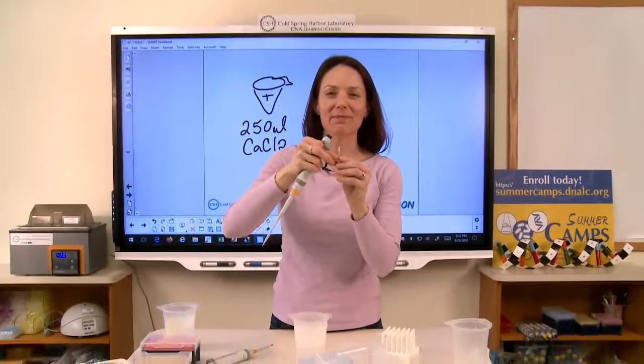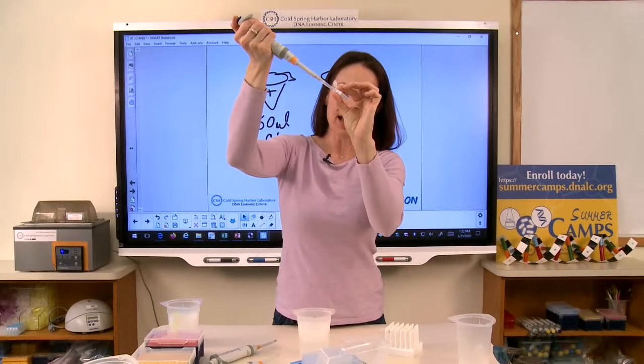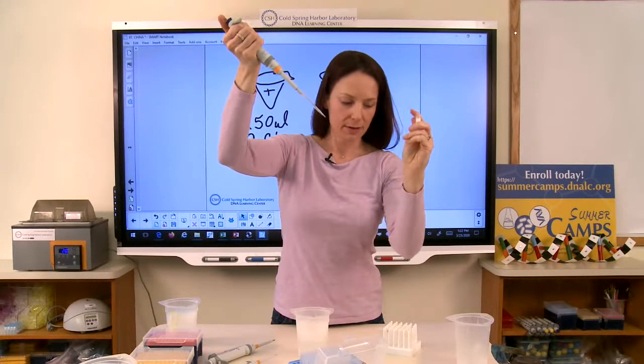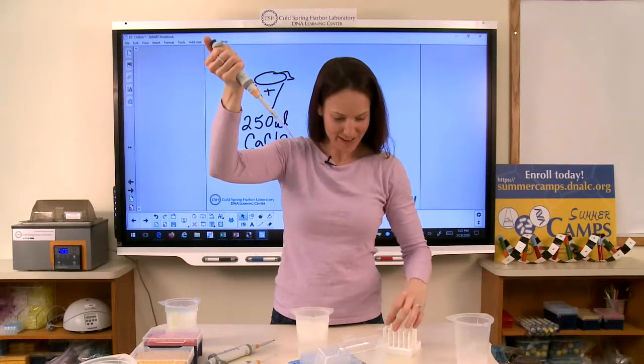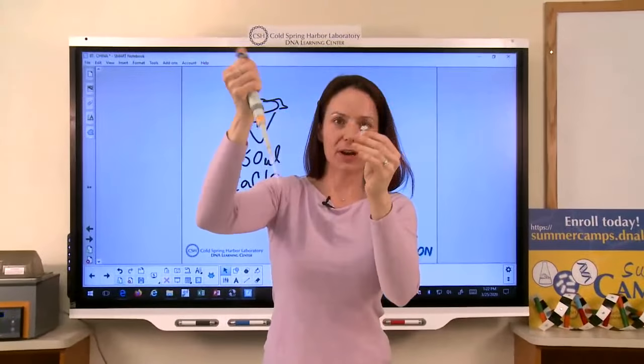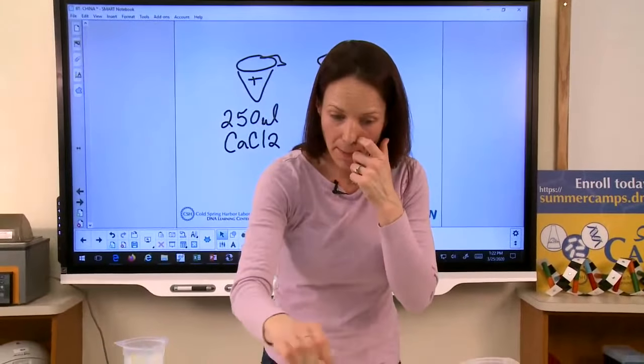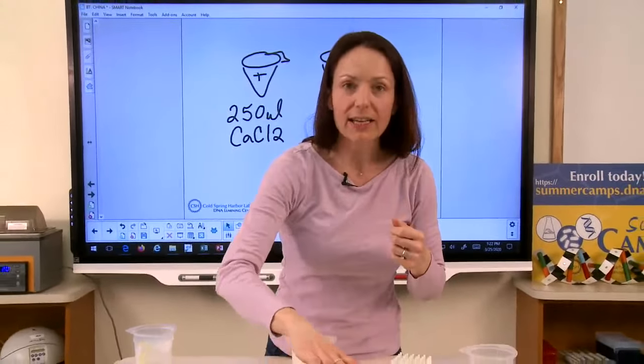Next tube, same thing. Open my calcium chloride, go to the first stop, gently place it in the liquid, and slowly draw up — no air bubbles. Let me get my minus tube. I'm going to close that tube and put it on ice. Then I'm going to change the tip. What I'd like to do now is I'm going to add the bacteria cells that we'll be using. In this lab, we're using a type of E. coli bacteria called MM294. These are harmless bacteria cells, and they're willing to take up the DNA that we want to introduce into them, so they're perfect for this lab.